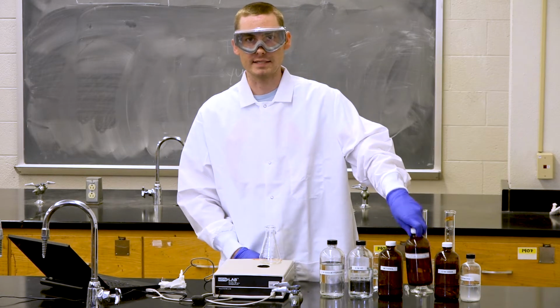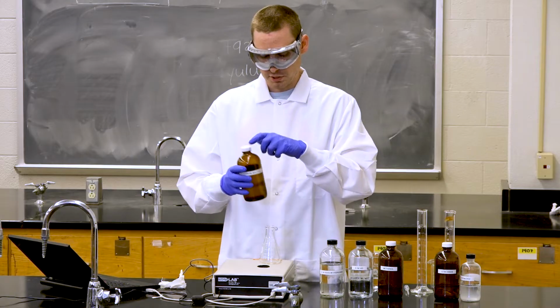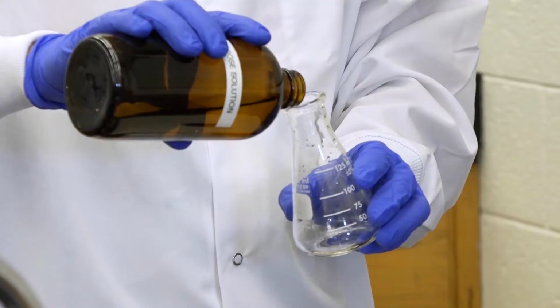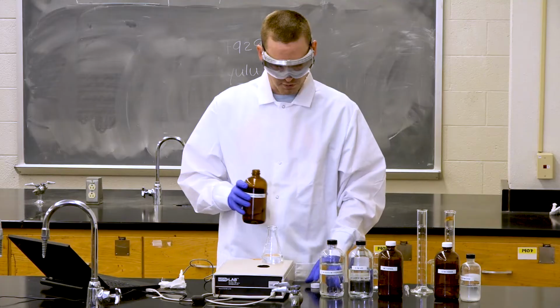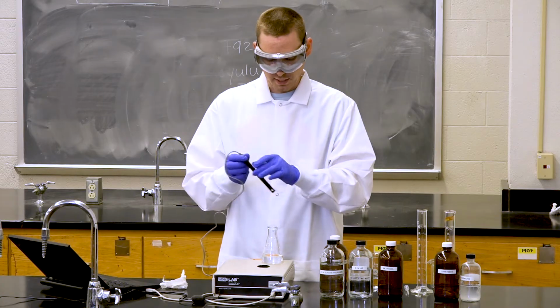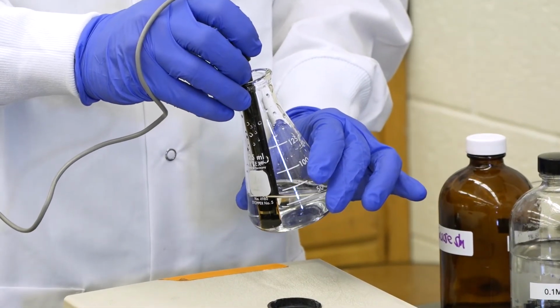So now that we have measured some solutions with ionic species in them, we're going to measure a solution that has a non-electrolyte in it, which is sucrose or table sugar. So we will add some of the sucrose water to our Erlenmeyer flask. We don't need very much, just enough to cover the bottom of the electrode.